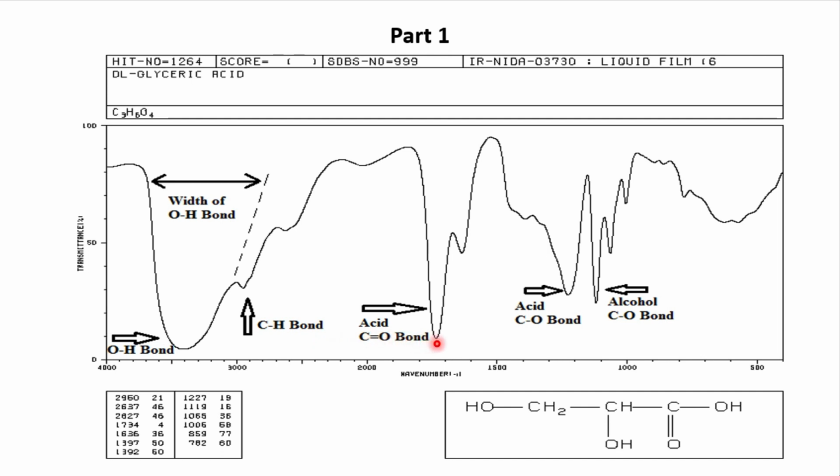Now, if you have a long peak like this, which in this case we call a strong peak, then this is possibly a carbonyl peak around 1,800 to 1,700 thereabout. And this peak around 1,200, 1,300, we can say is possibly a CO group from an acid, so possibly a carboxylic acid. And we also have another one here that shows a CO bond, possibly from an alcohol.